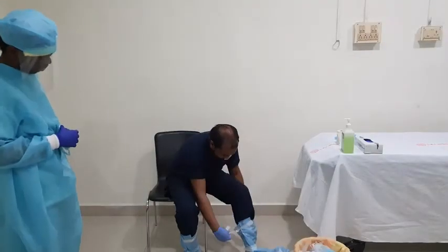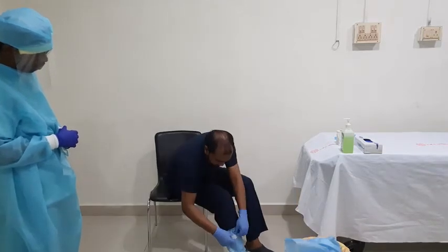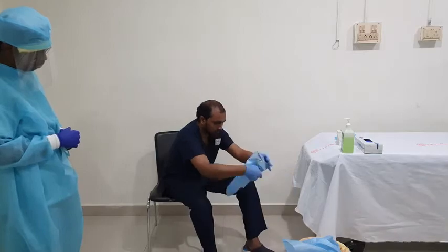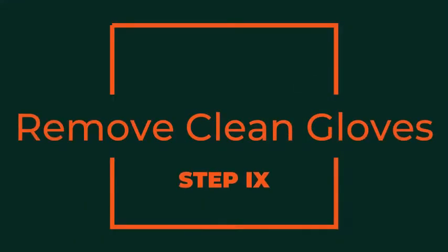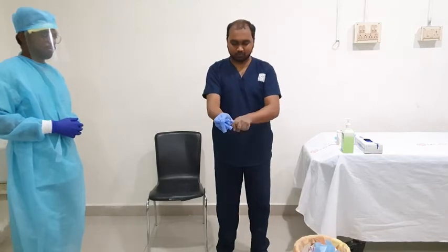For removing the foot cover, use the chair provided at the doffing area. After removing it, discard it into an appropriate container. Discard the cleaning glove into the infectious waste bin.